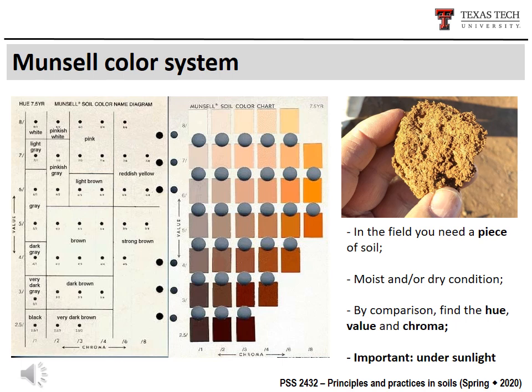By comparison, you can try to find the hue, the value, and chroma. And it's very important to measure the soil color under sunlight.